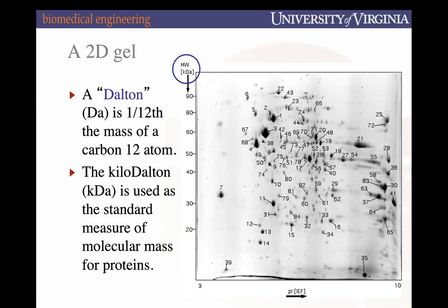One thing that's noteworthy is that there might be times where you see a blur. For example, protein 21. A lot of these are not clean circles or clean bands on this 2D gel. What ends up happening is, as we discussed in this class, proteins are altered all the time.